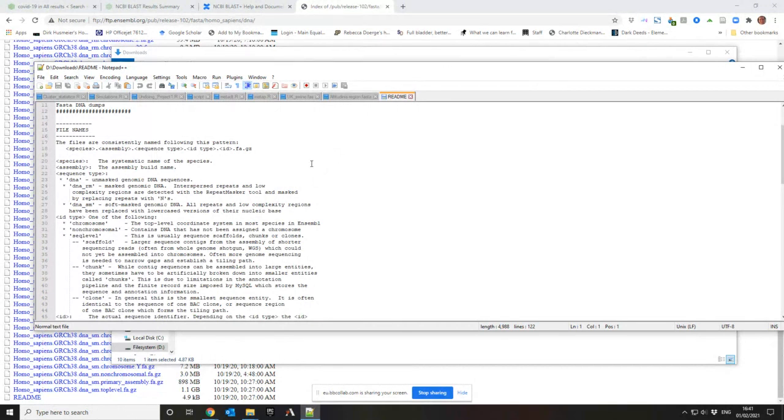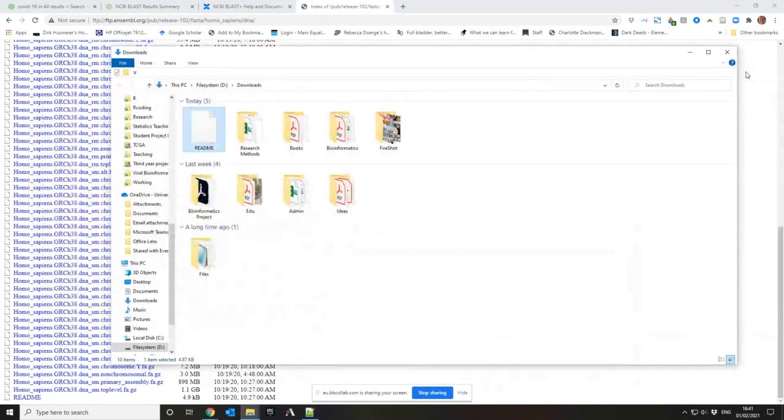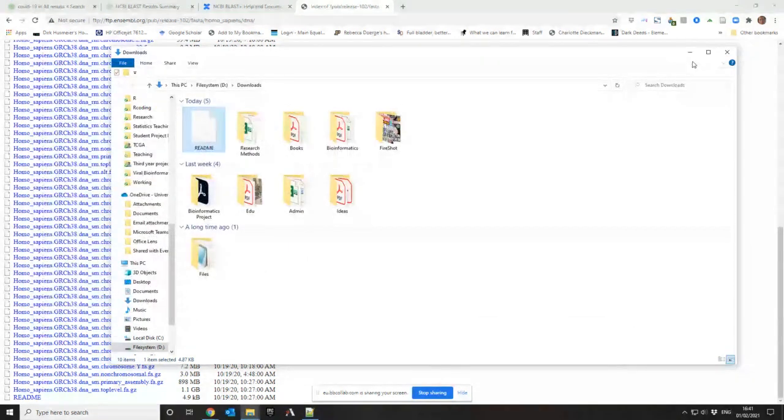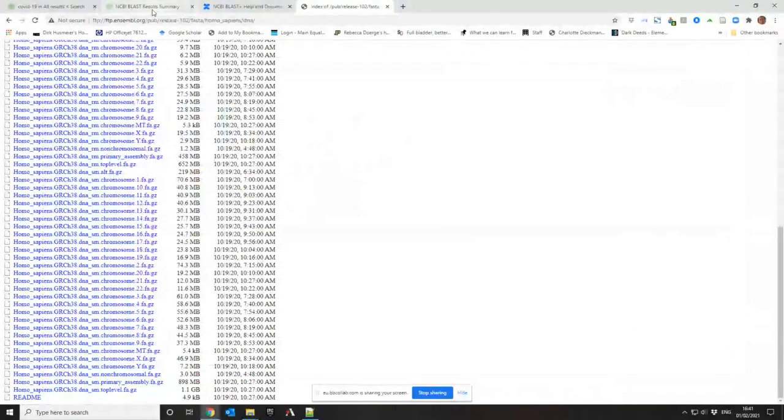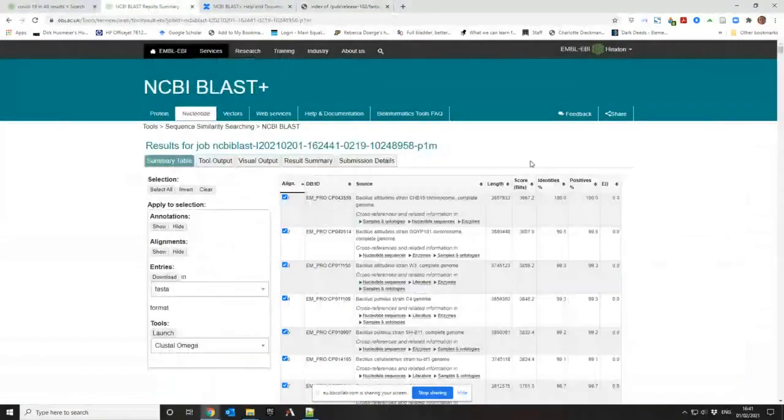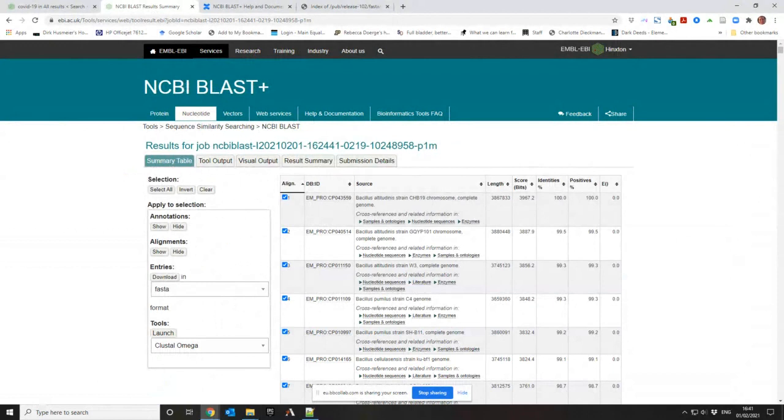Remember when you're reading through the textbook they're talking about these DNA fingerprints—variable regions. They're just repetitive things that are not going to contain genes, so you can get rid of them. Because otherwise, when you do a search, you're wasting time searching through an area where there's going to be nothing interesting. Has the BLAST thing done it? Yes, BLAST has finished.